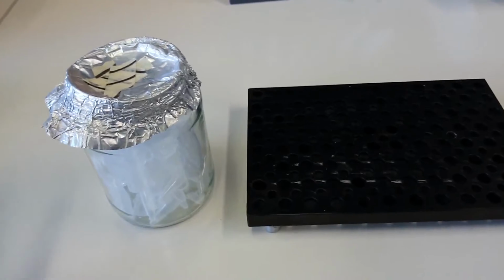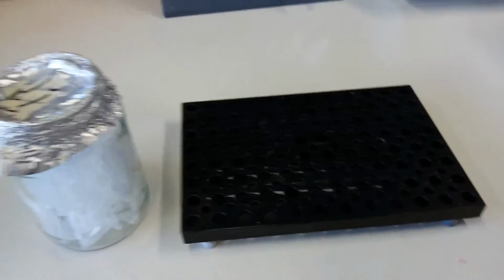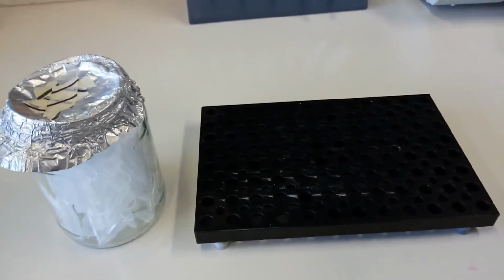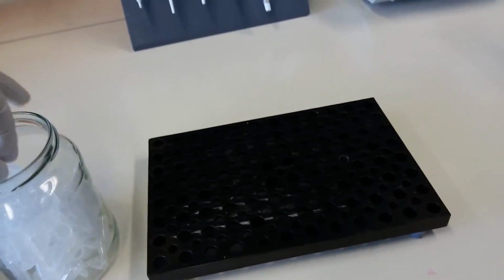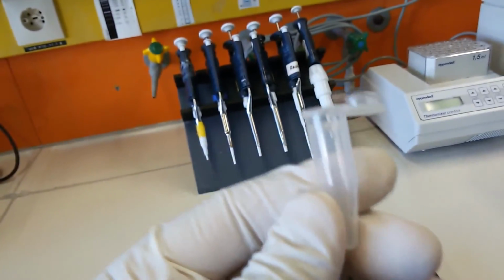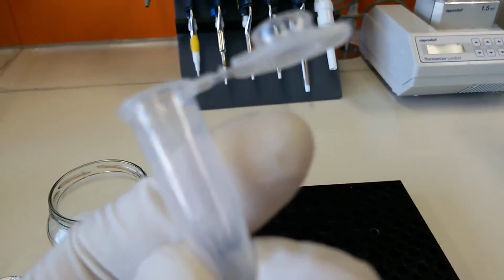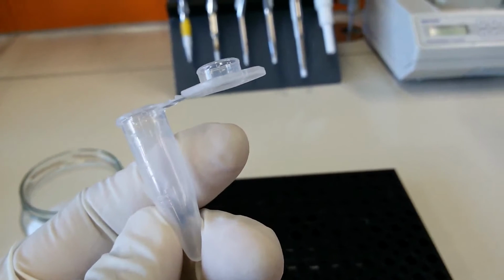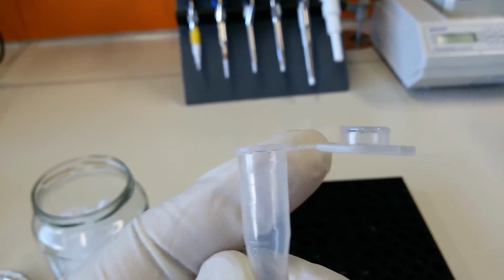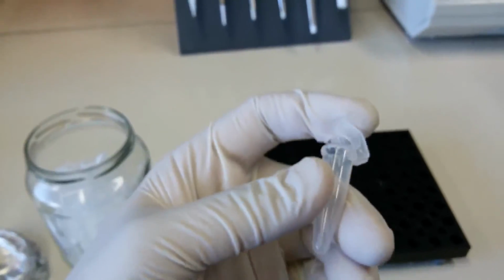We sterilize them using an autoclave. I will tell you about the autoclave in detail. This tutorial is just to make you familiar with the different terms that are common and that you should know. Now I can pick some tubes for you and show you what they are. So this is a 1.5 ml tube, and it's written somewhere, 1.5 ml. Let's find out where it is. Give me a second. So you can see this is 0.5, this is 1, and this is written 1.5 ml. So this is a 1.5 ml Eppendorf tube.